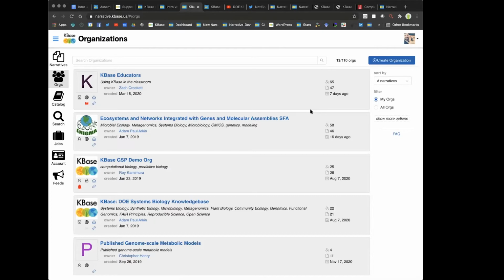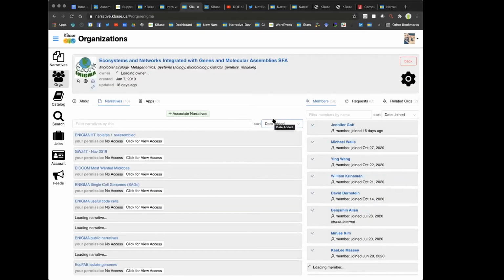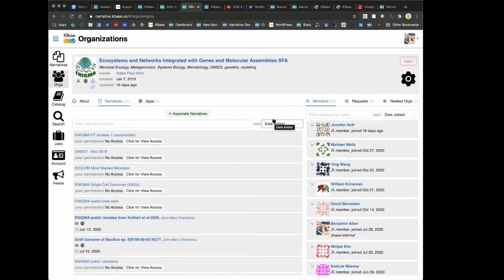I'm just going to open one up here. This is for the Enigma project. So it will load the organization. As I showed when I was sharing my narrative, if you're just sharing a narrative with one or two people, it's very straightforward. You can just type in their username or search them. But if you're trying to share it with hundreds of people, it starts to get challenging.